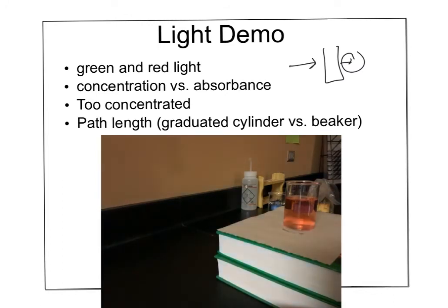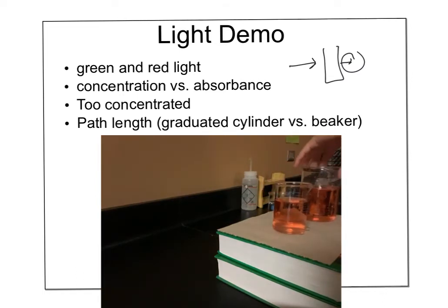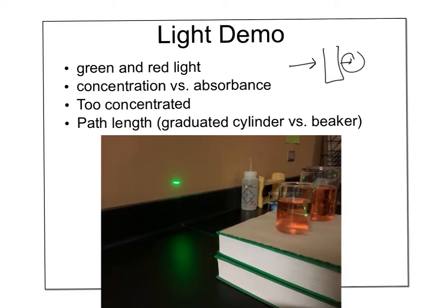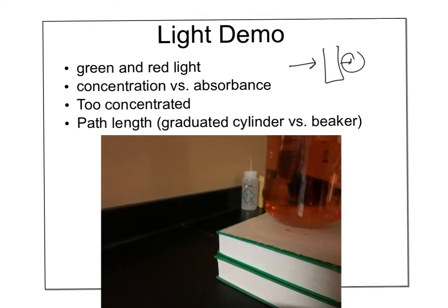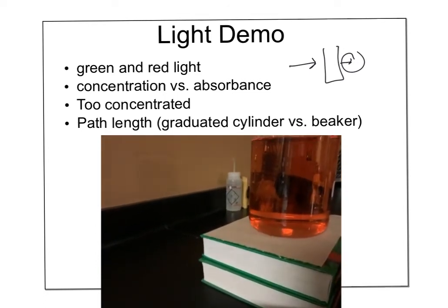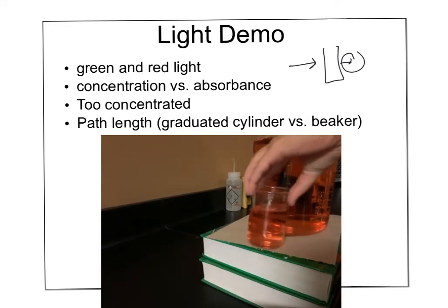All of these are the same solution. And I know I said graduated cylinder, but I just got 2 different size beakers. Okay, so here we go. Oh, I don't want the letters to be blocked. Okay, here we are before. Short beaker, medium beaker, so short, medium, and now let's get the mega beaker. Oh yeah, that's a big one. So hopefully let's even just go small to big.